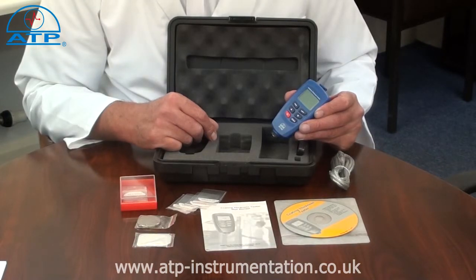Measurements can be made individually or continuously, with a display of the average, minimum, and maximum measured values for continuous measurements.